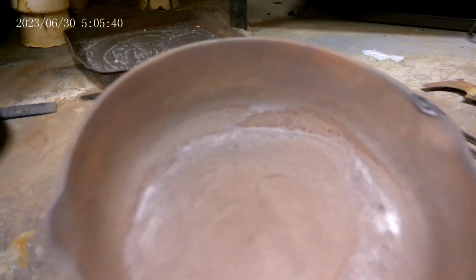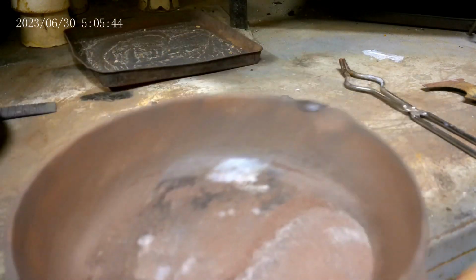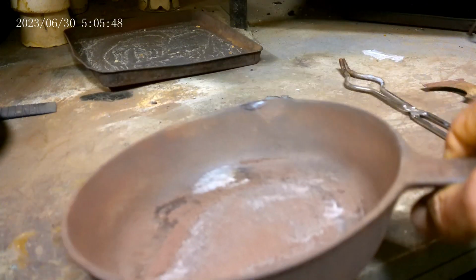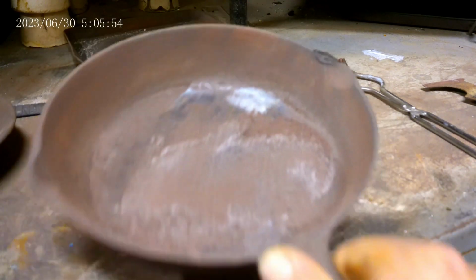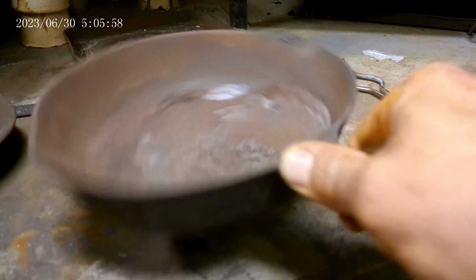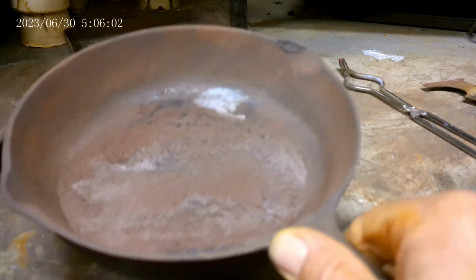Okay, well that was kind of a mess. That stuff stuck to the pan. I had to scrape it off. It was kind of in chunks. I had to grind it down through a screen with this. But I got it all ready. I'm going to get this weighed out, see what kind of weight we lost from the original weight. See what we got.